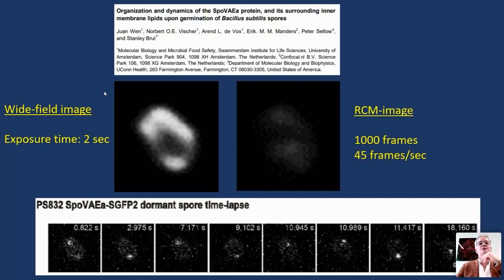So it was always thought that these molecules are in groups at the surface of the spore. So this is a spore which has a size of something like 1 micron. It's a noisy, or a blurry image, but you have to realize that from left to right is about 1 micron.